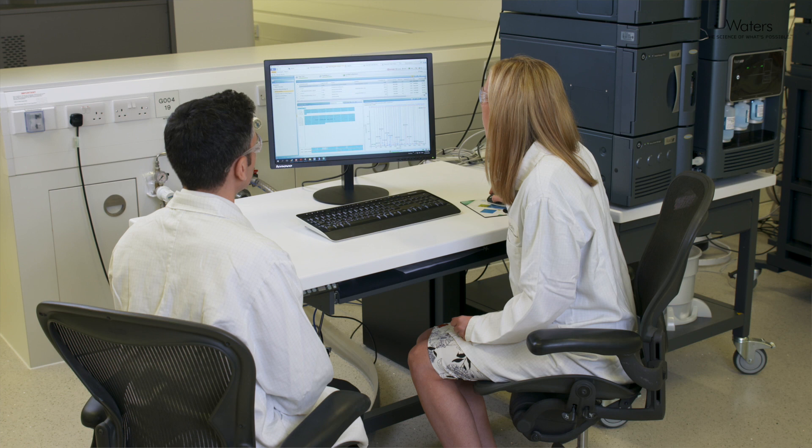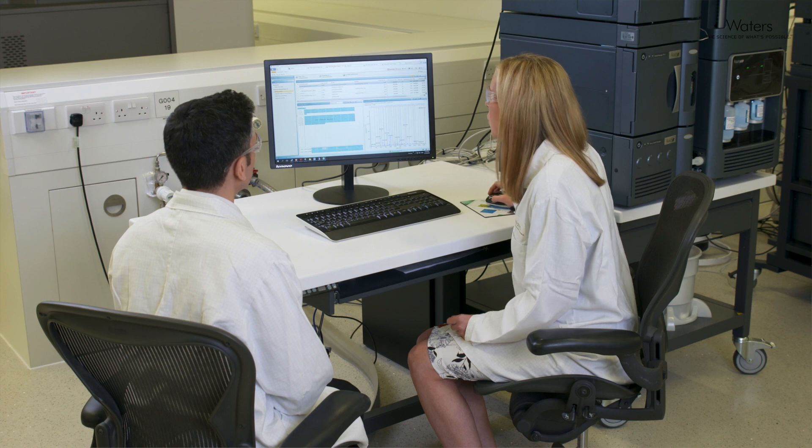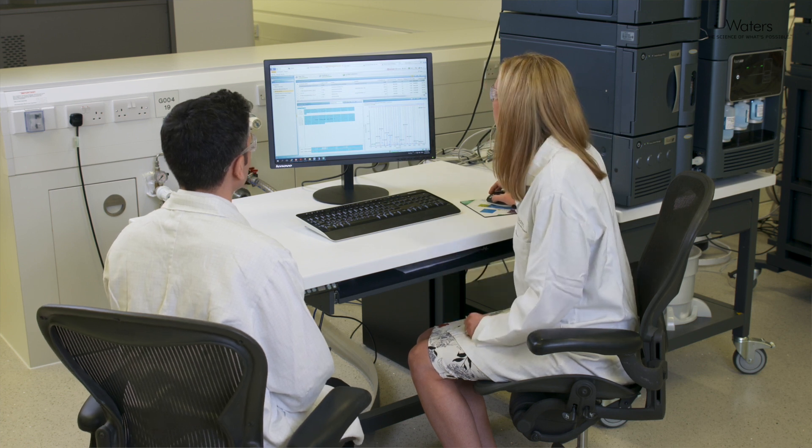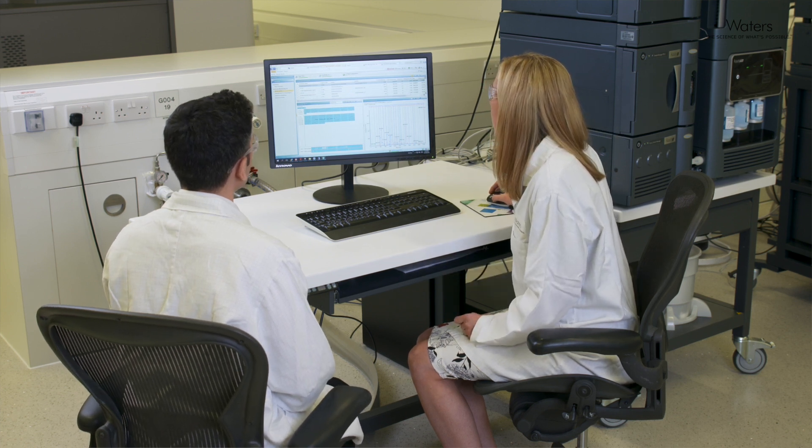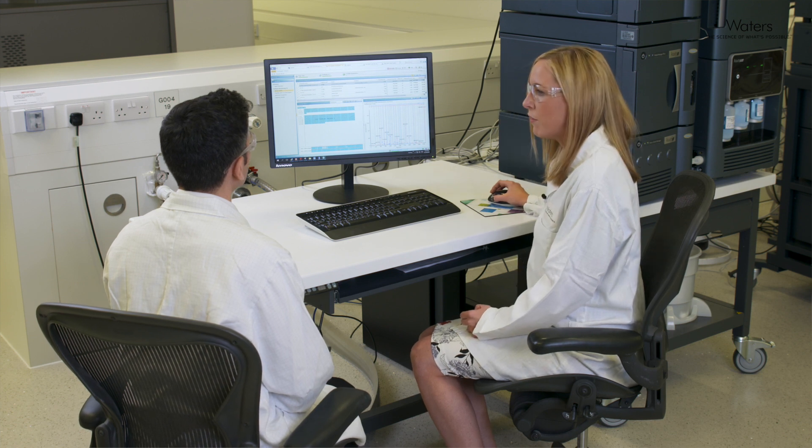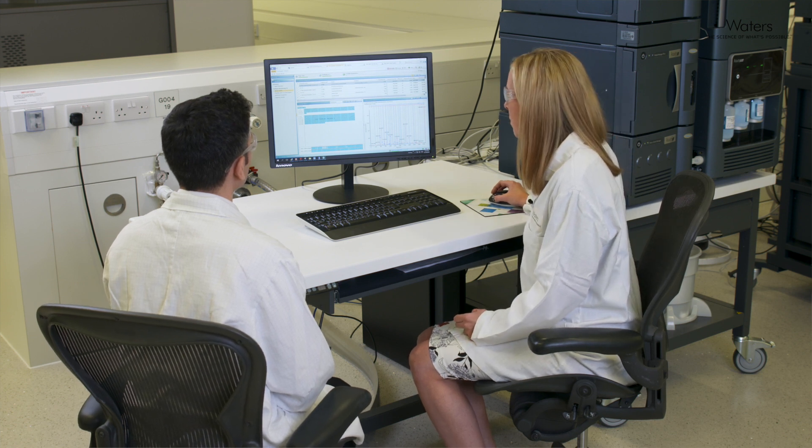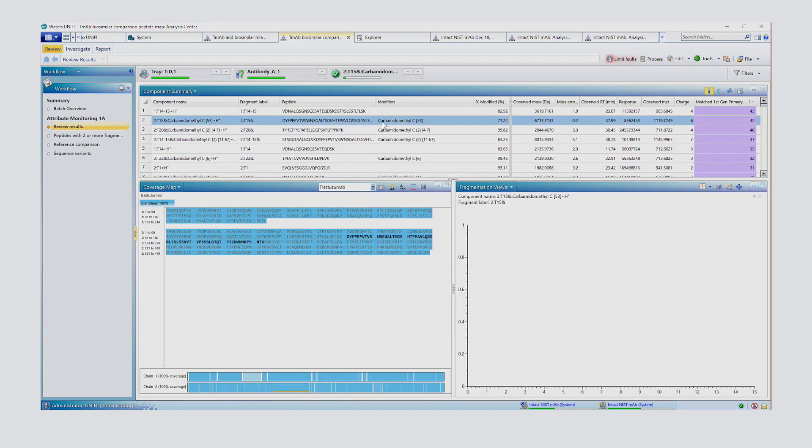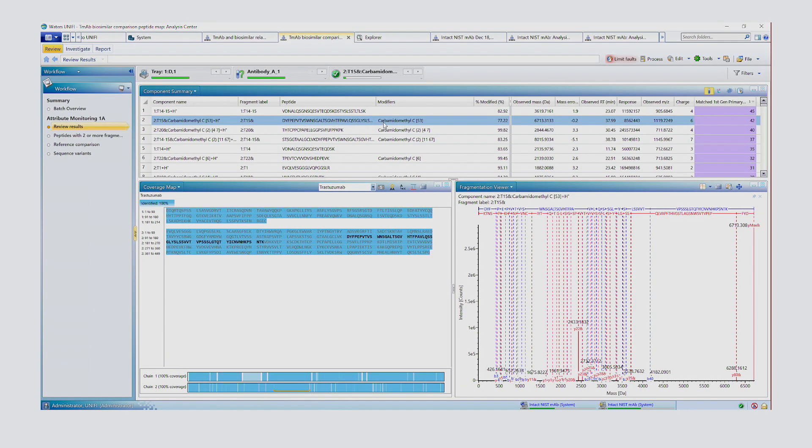What about peptide monitoring? Okay, so the system is set up to do peptide mapping and monitoring experiments. So if we click onto this experiment here, we have a peptide map experiment of trastuzumab. So we have a slightly different workflow here.